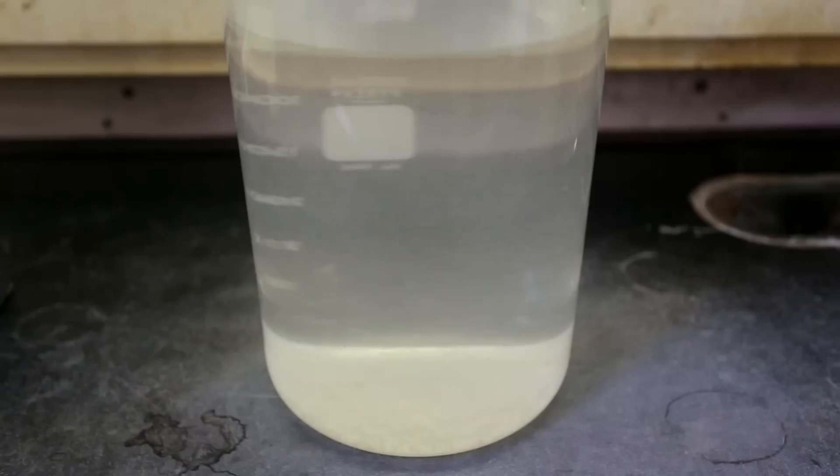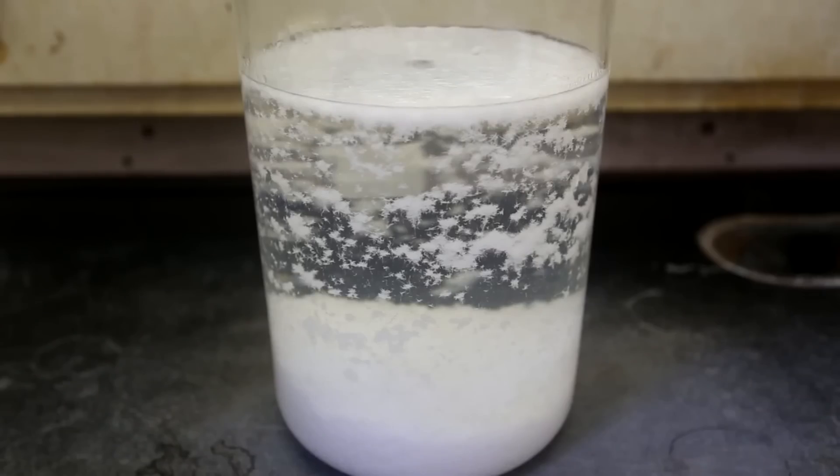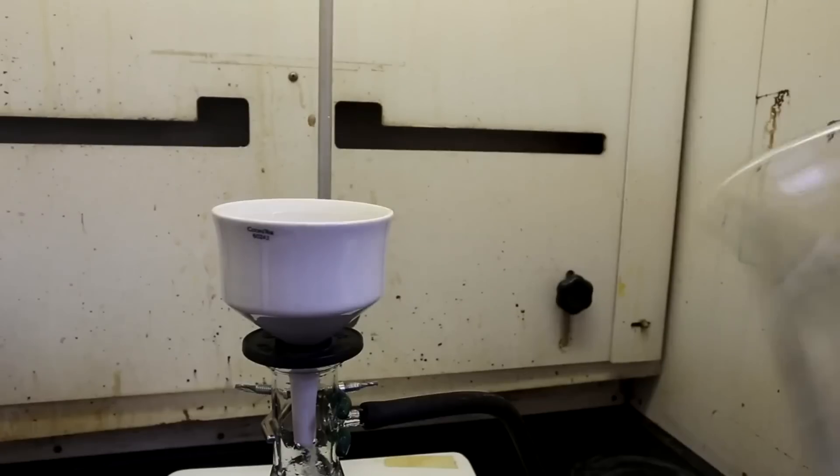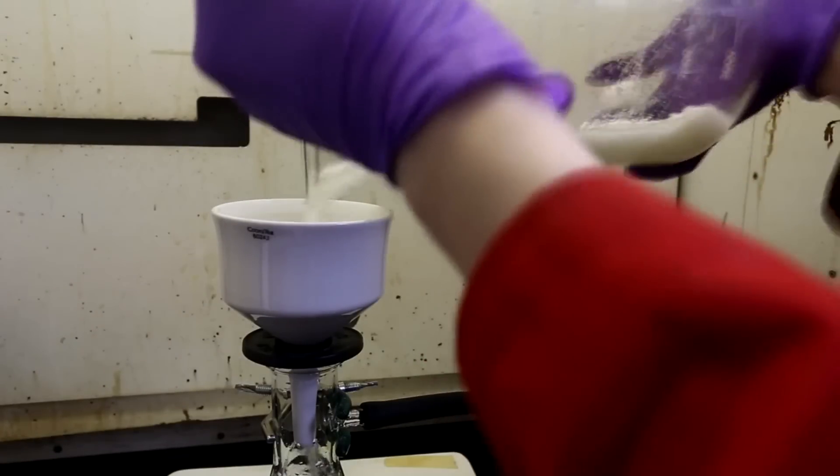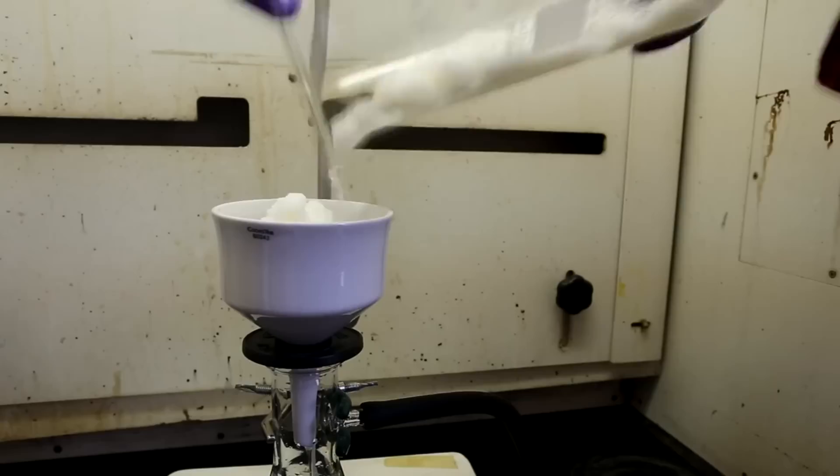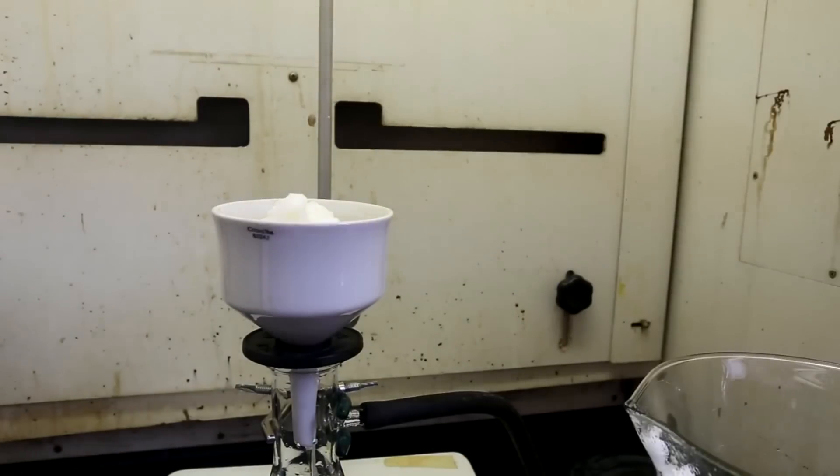Because salicylic acid is so insoluble in water, it took about 4 liters of boiling water to dissolve it all. The crystallized product was filtered off using vacuum filtration and left to dry in a 120°C oven overnight.